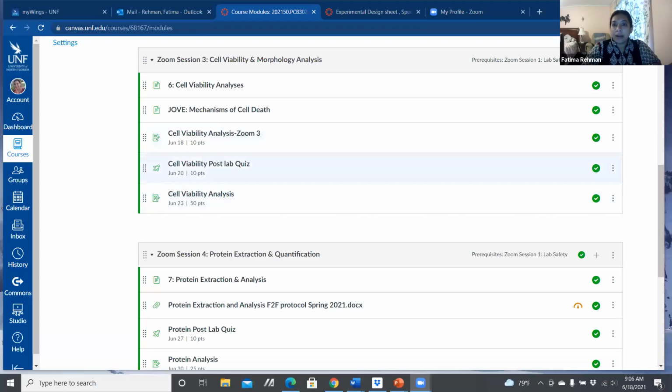Okay, so I'm going to go ahead and share my screen so we can start talking about our module this week and what we are going to be focusing on. So this week we are doing cell viability and morphology analysis. We talked a little bit about the morphology stuff last week, and that's why I had you take that quiz last week, because I wanted you to be a little bit familiar with the different parts of the cell and the way the cells may show when they're going through different stages of maybe cell cycle or different types of health conditions, and how that would show.